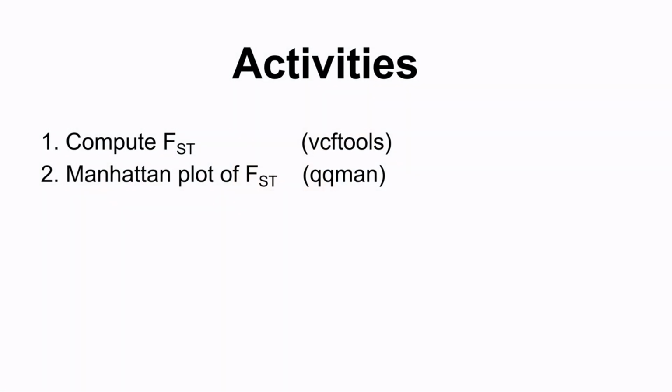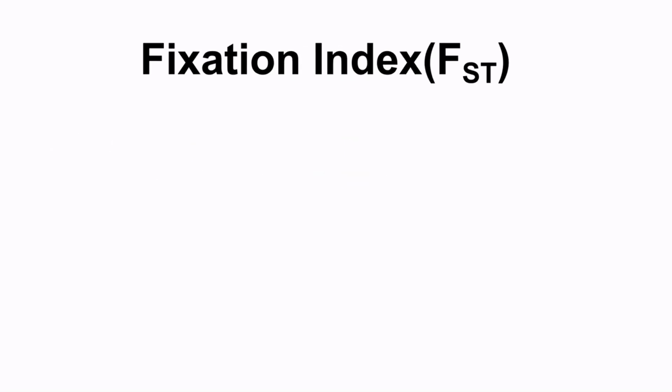In this tutorial, I am going to show you how you can compute FST values using VCFtools. After that, we will visualize the FST values in a Manhattan plot using the R package called qqman. But before we start the exercise, let's look at what an FST value is.